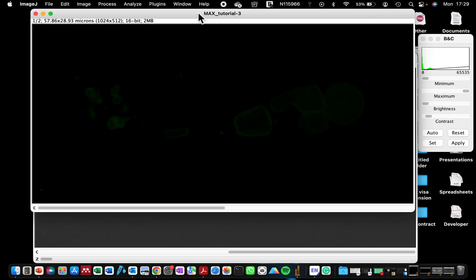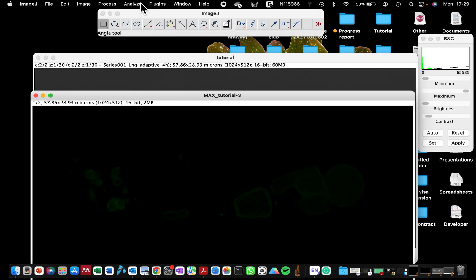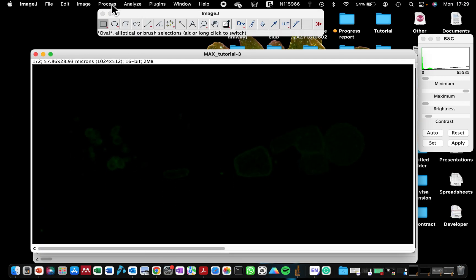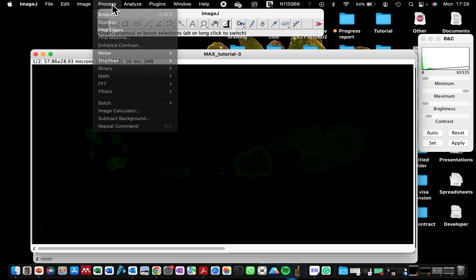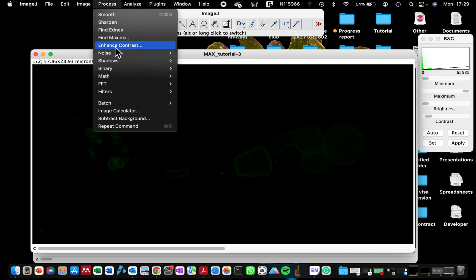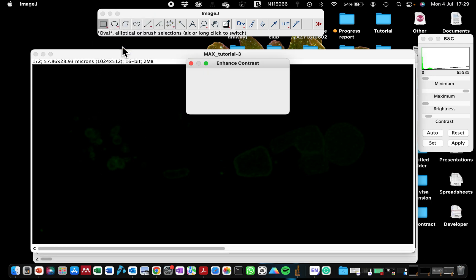So the second option that I was talking about is to use the enhanced contrast, which is just by going to Process. And you can see here it says Enhanced Contrast. If you click on that.